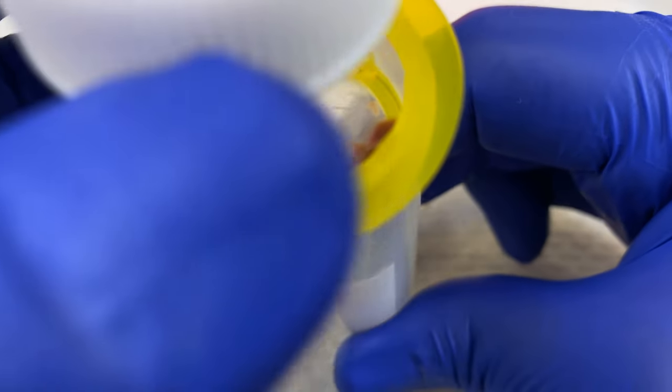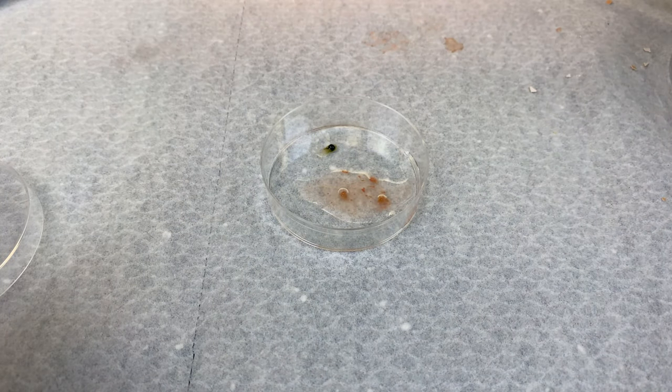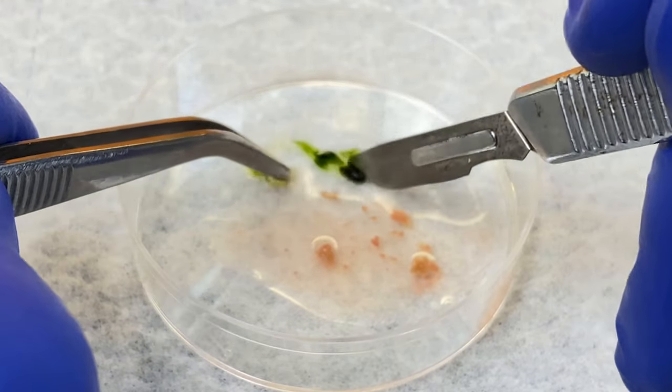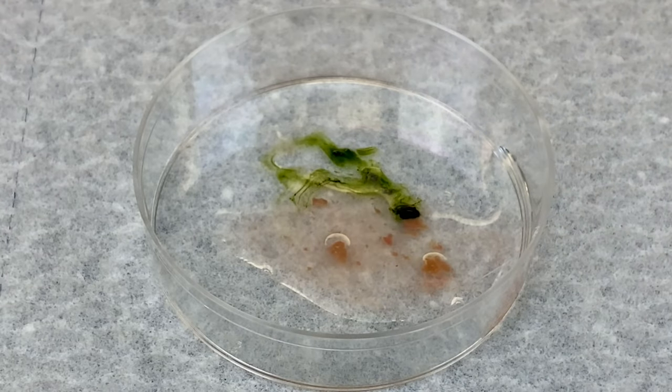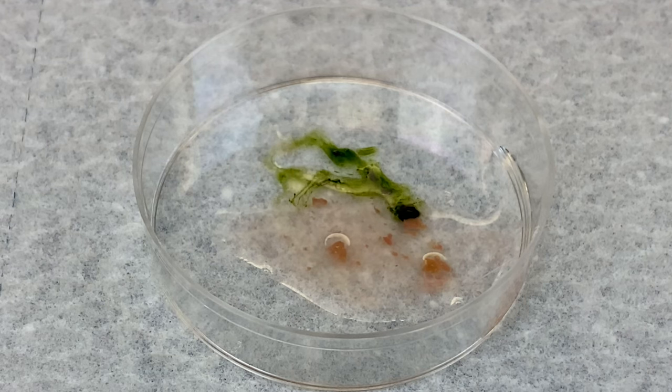Before I move on, I do want to show you the gallbladder. It looks black, but it's actually green in nature. Bile is made by the liver and stored in the gallbladder. It's used to help absorb fats into the intestine.